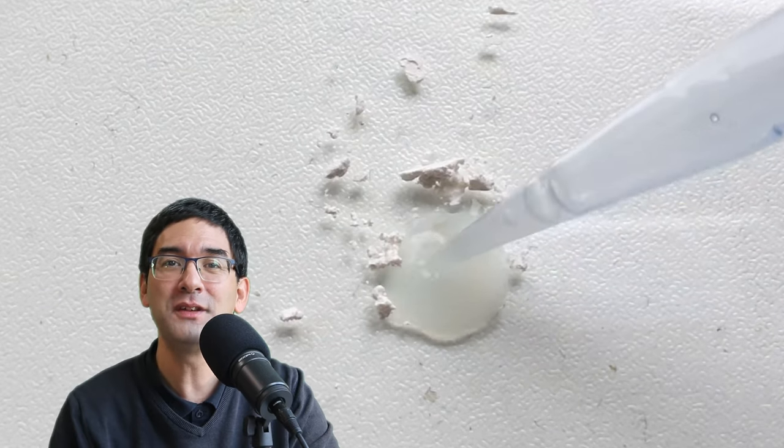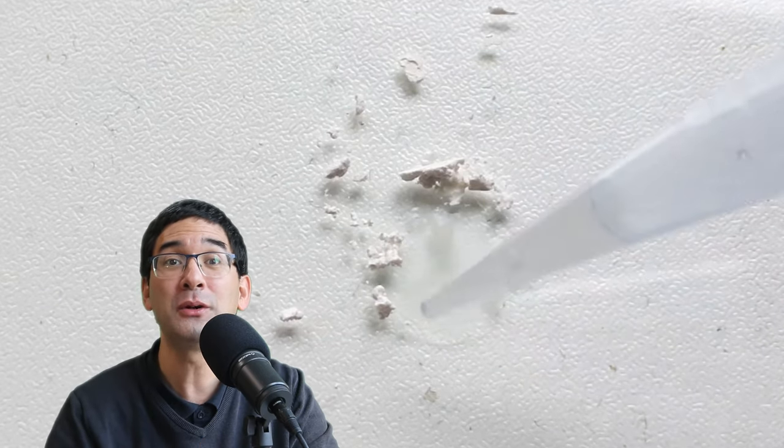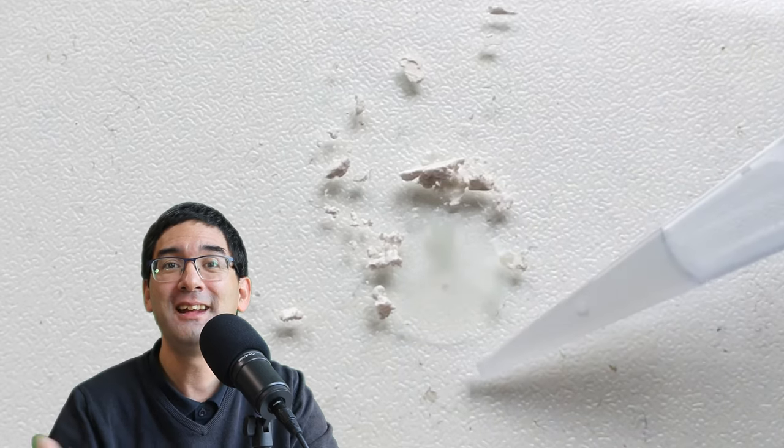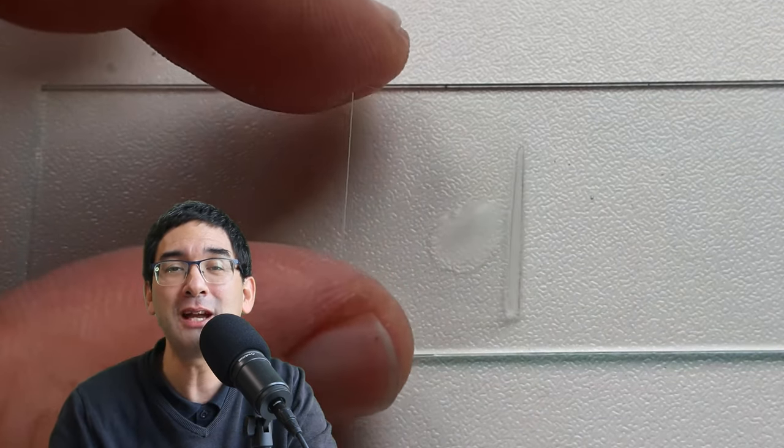I've taken out a small sample of this diatomaceous earth, mixed it with water, put it on a microscope slide and then observed it. And what I'm going to do now is I'm going to go up with a magnification. So I'm going to start at the low magnification using a four times objective. We're not able to see a lot, really.